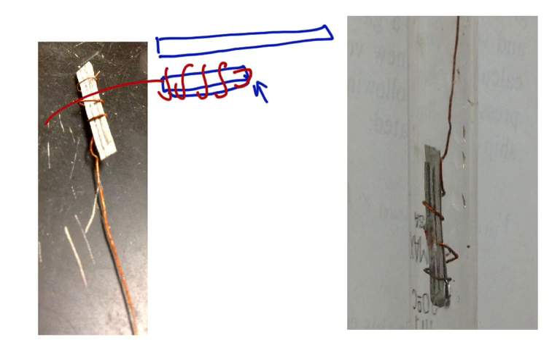And then we can take that little piece of wire, we're going to put it into the end of our tube, so that it ends up here, just before where the numbers start. So you're going to get that above those numbers, because when you turn it upside down, you want that to be below the numbers so we can capture the big bubble of hydrogen gas.